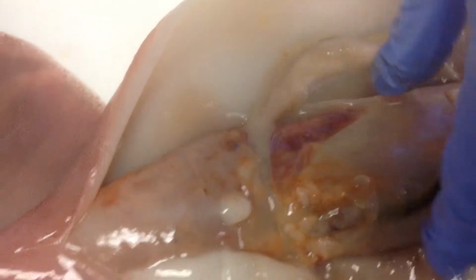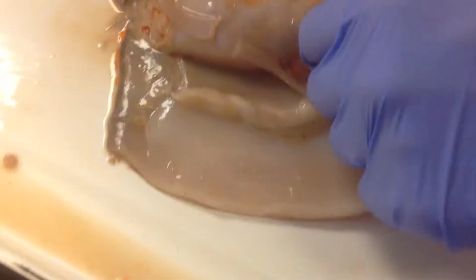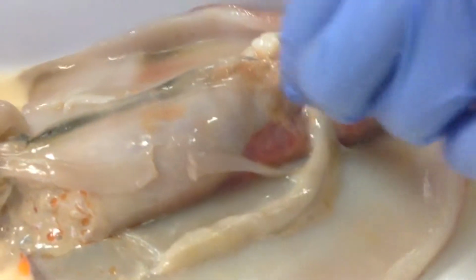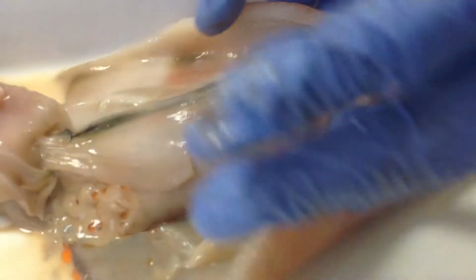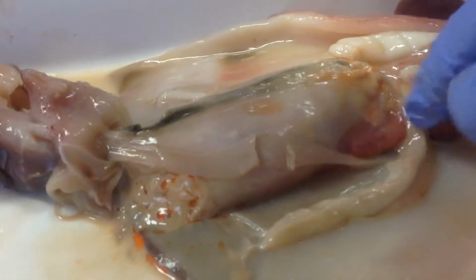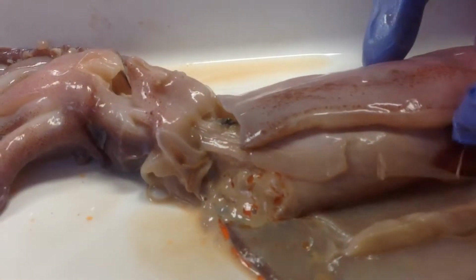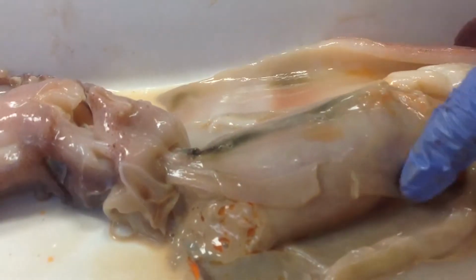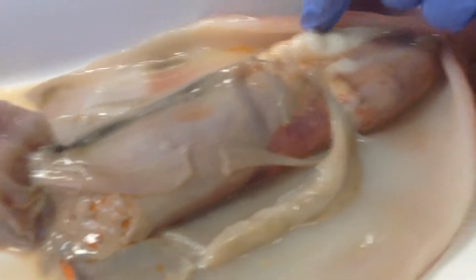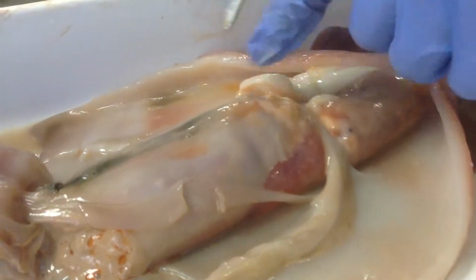Look here. Let's see. Interesting enough, the film that's covering this main segment of organs was able to hold in whatever damage was done to those organs. So this is a pretty strong adaptation that really cements its organs into place in an otherwise loose-fitting body. So if injury were to occur, it could repair itself. It had a chance to, yes. Yeah. This damage is also congruent with our bruises on the outside. It might have caused an internal bleeding that led to this organism's death. Yeah. Or post-mortem. This could have happened.